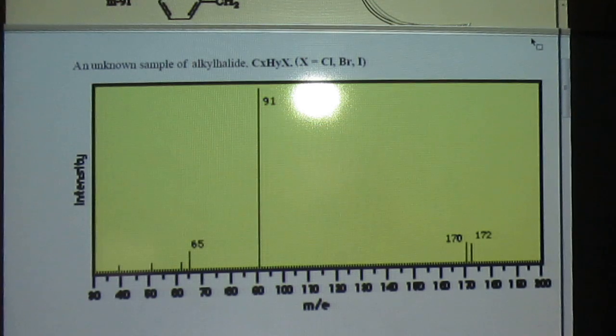CXHYX, where X can equal either chlorine, bromine, or iodine. And it's showing us this mass spectrum here.